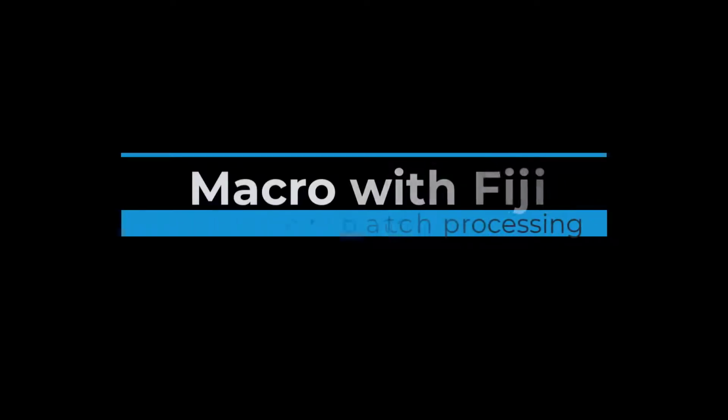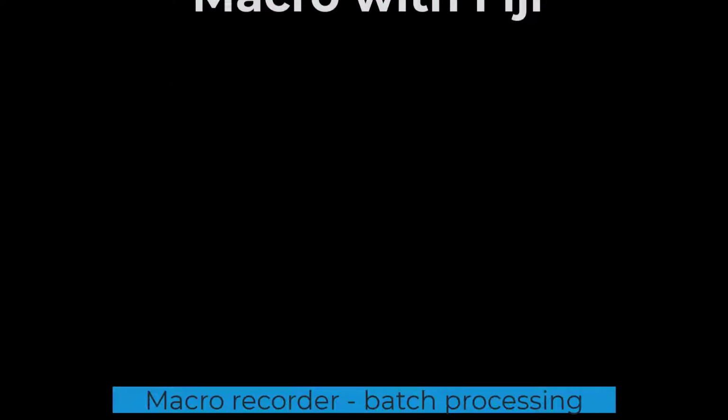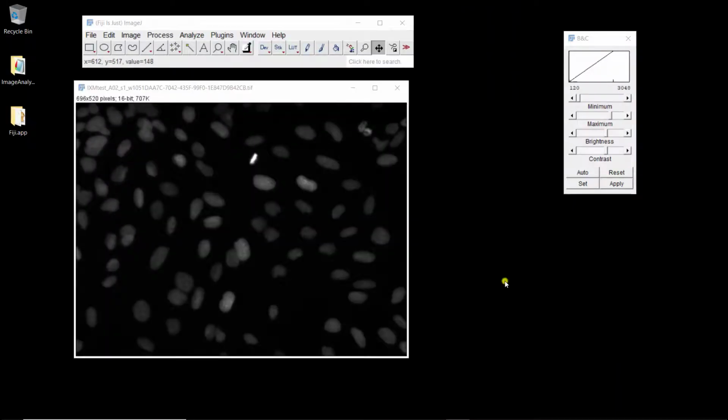In this video, I'm going to show you how you can build a macro with a macro recorder and then insert what you recorded in another macro to process an entire folder of images. So here we are with the same image as before, and we're going to record the different steps that are required to segment nuclei with the same steps that we used with the CLIJ assistant.